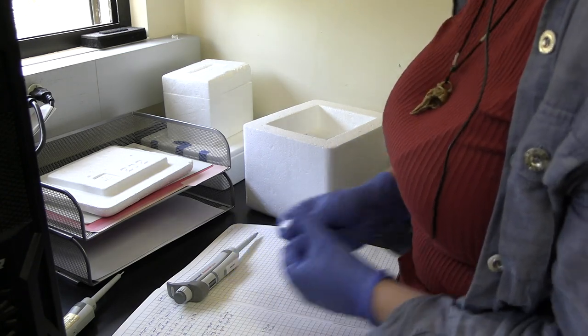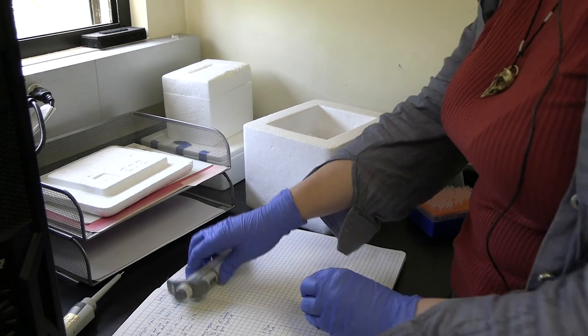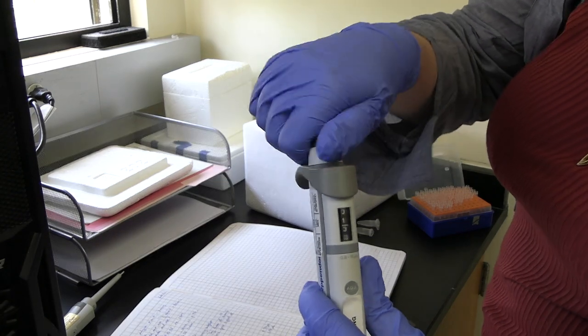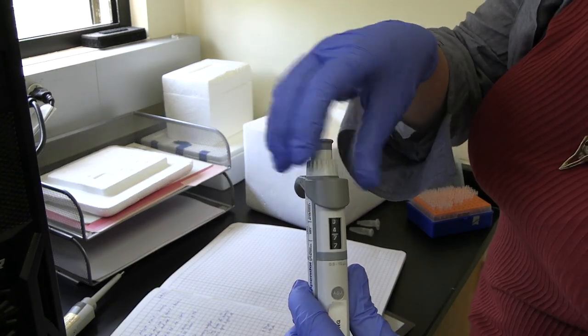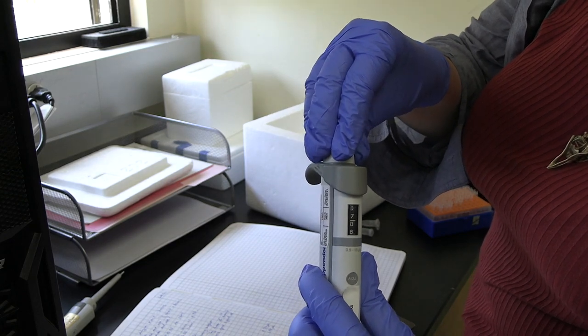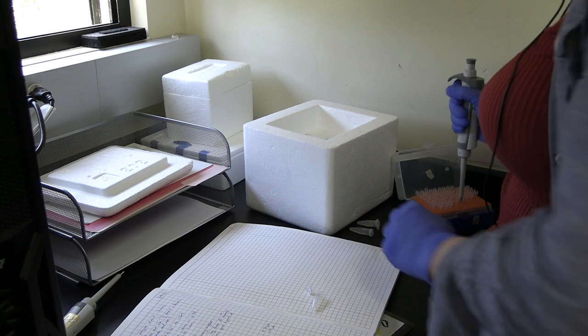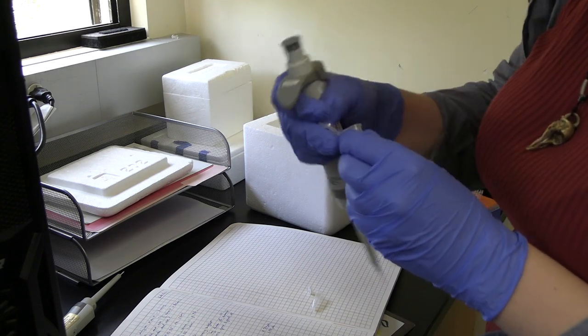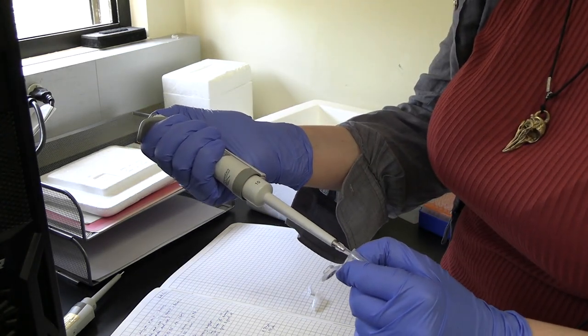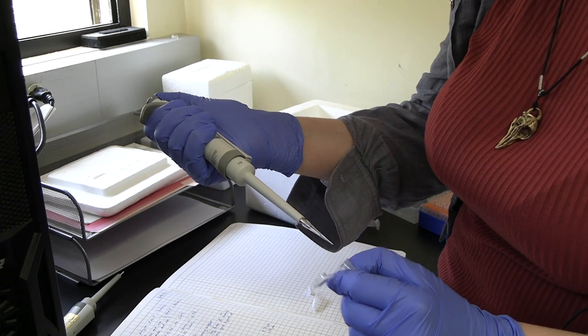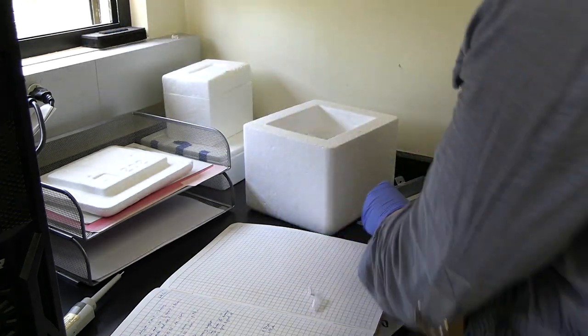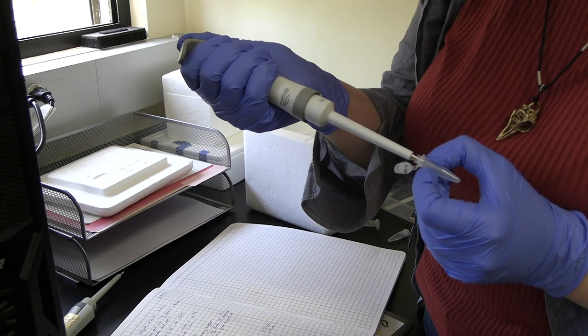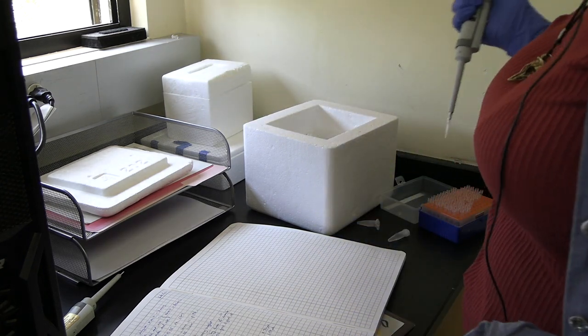I've labeled a tube here, K-clusters for kinesin clusters. First thing I'm going to put down is our PEM buffer, 7.07 microliters. Depress my pipette, draw, take it out. Looks like about 7, that's good. Carefully add, then dispose of my pipette tip.